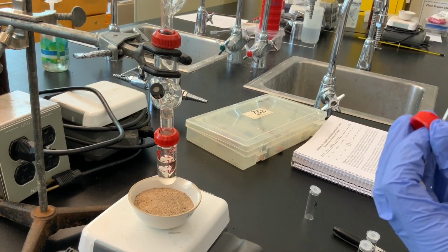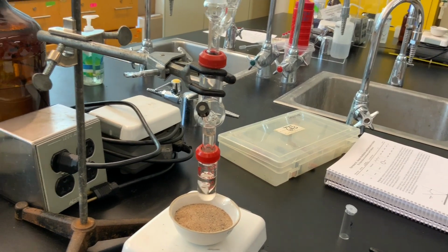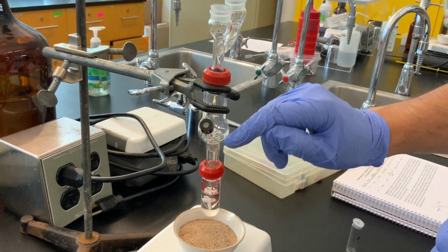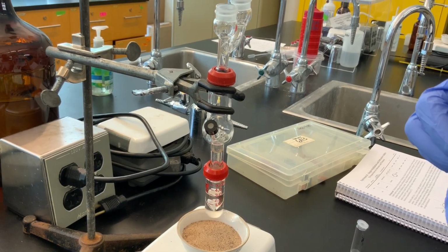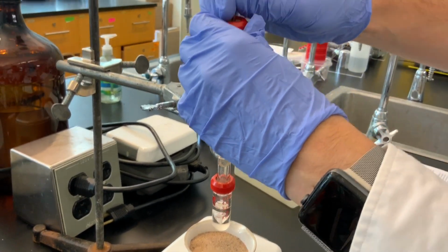And the first liquid that will boil and then in its vapor form condense on the cooled glassware here should be, of course, the lower boiling solvent, hexane.